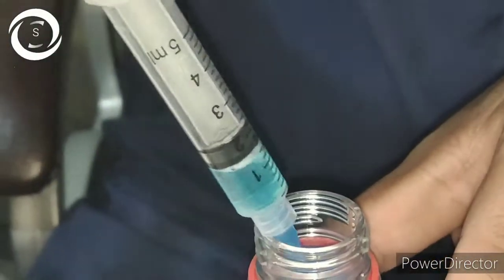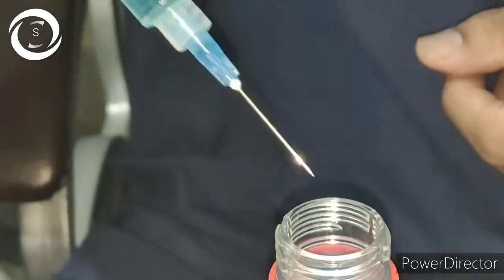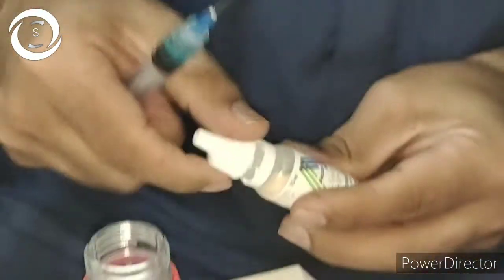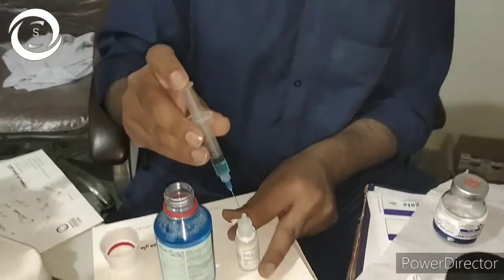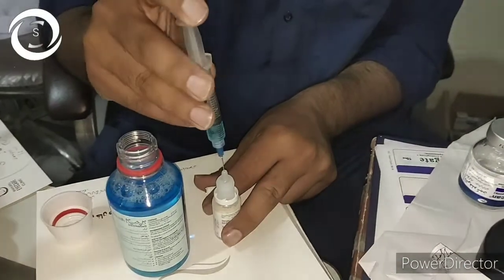Take 1.5 ml of mouthwash containing 0.2% chlorhexidine in a 5cc BD syringe and put it into 15 ml of artificial tears. That will roughly make it 0.02%, which is the required concentration. Here we are putting the 1.5 ml into the 15 ml drops.